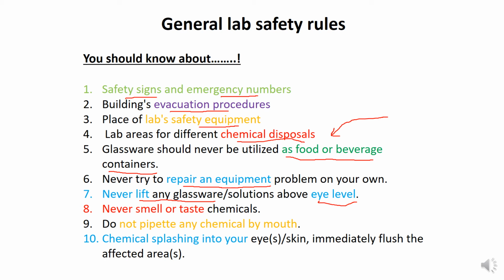Never smell and taste, of course, we already discussed this. Do not pipette any chemical by mouth. Okay, so this is really very important.